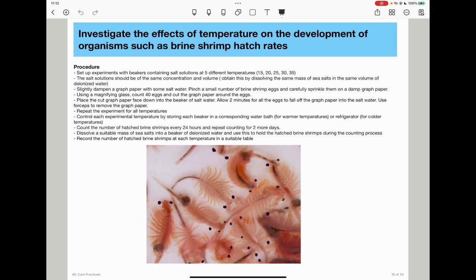You can then use sterilized forceps to remove the graph paper and discard it, carefully ensuring that all the eggs have fallen off. We will repeat the same procedure for all other temperatures. We have to make sure we control specific variables — for example, if I am carrying out the experiment at 15 degrees, I must ensure that temperature remains at 15 degrees. We can use corresponding water baths or specific refrigerators to ensure temperature remains exact.